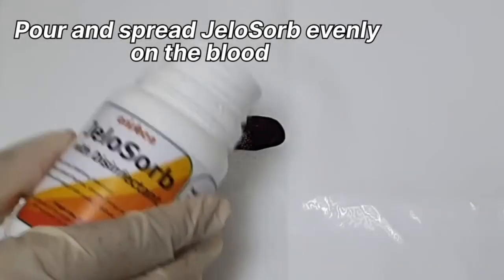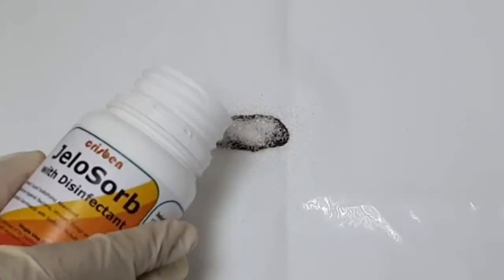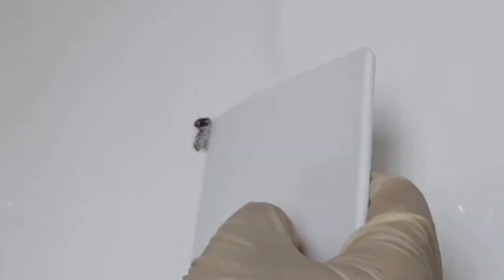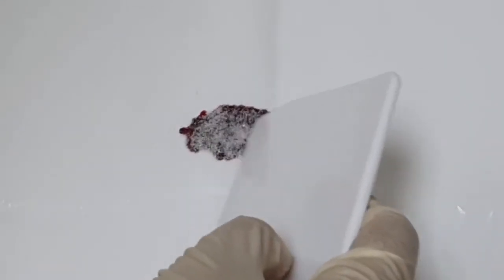Jellisorb coagulates blood for easy recovery and disposal. The disinfectant in Jellisorb effectively neutralizes bacteria, parasites, virus, germs and protozoa, preventing them from spreading — especially going airborne. This is important to stop the transfer of infectious diseases to other areas.